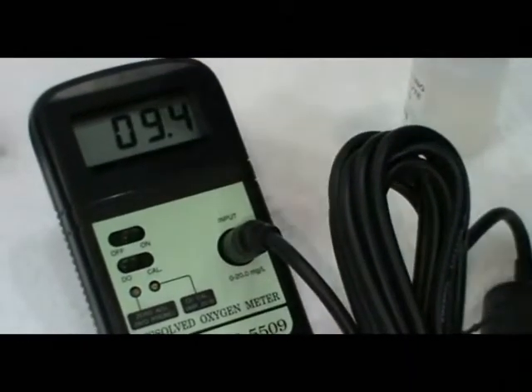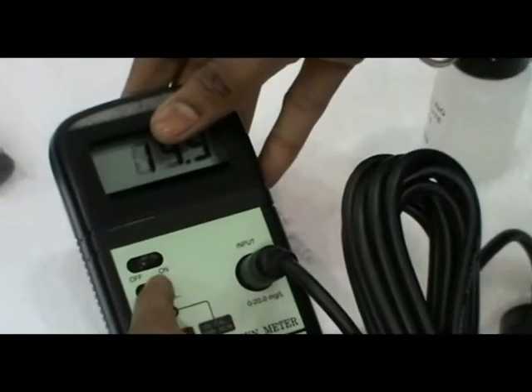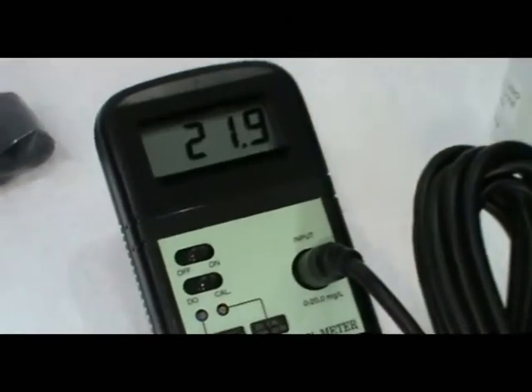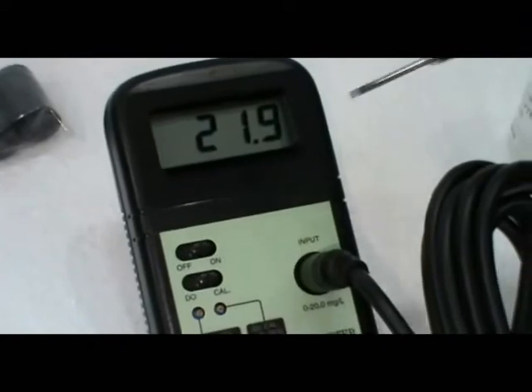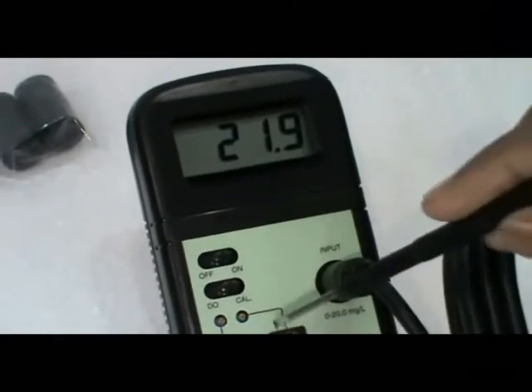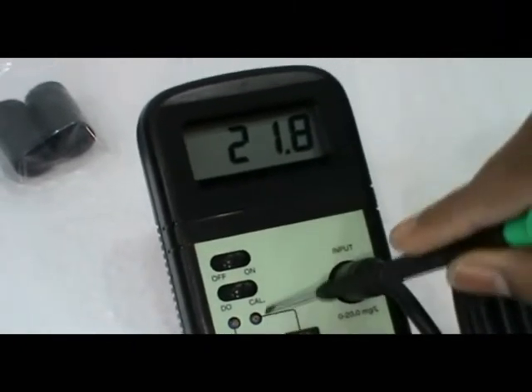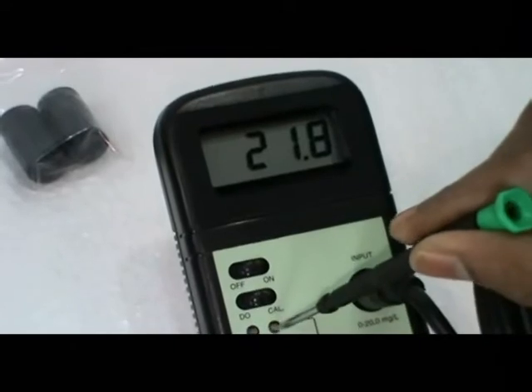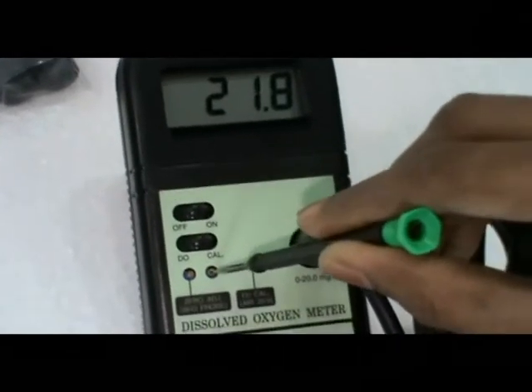Change the mode to calibration. This is the air calibration. Set the value 20.9 in display by adjusting the screw using the screwdriver.